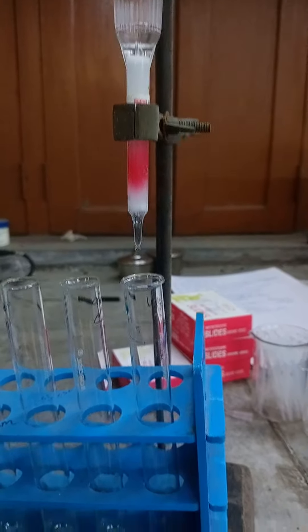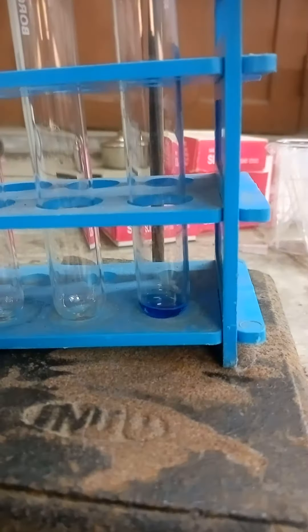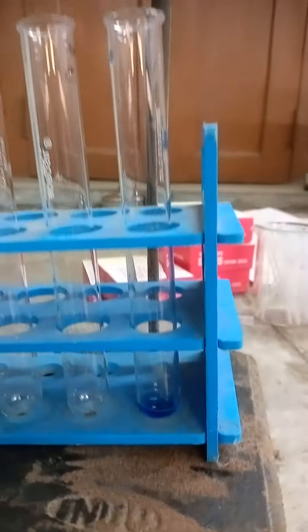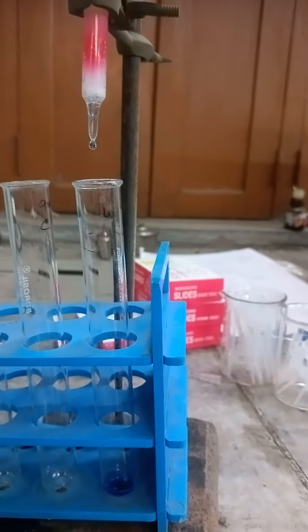Fraction separation in column chromatography. As we can see, the first compound coming out is a blue colored compound, which is dextran, a 2000 kilodalton molecular weight compound.